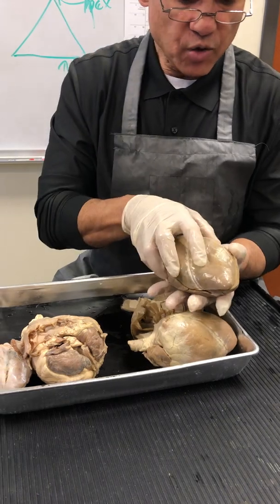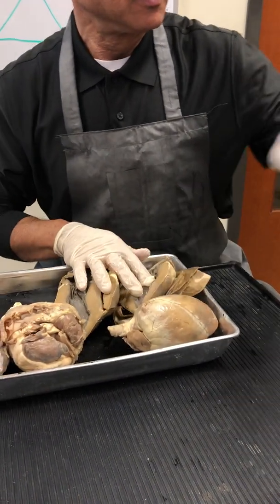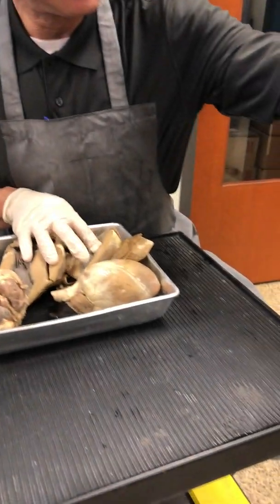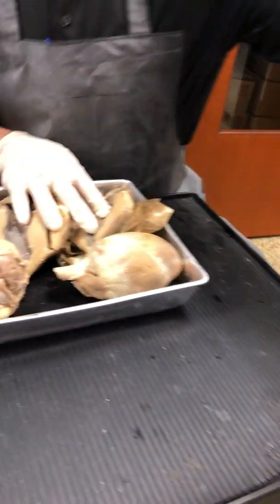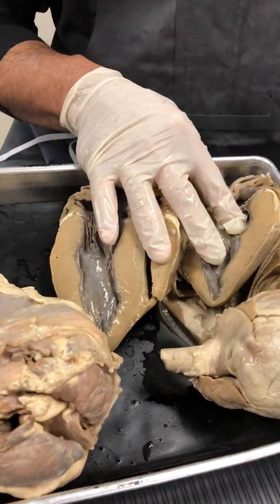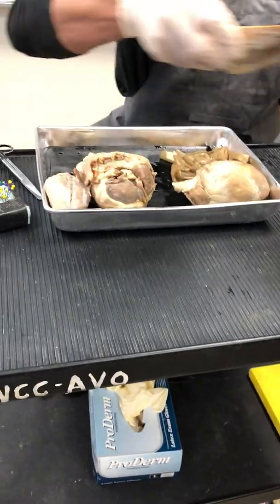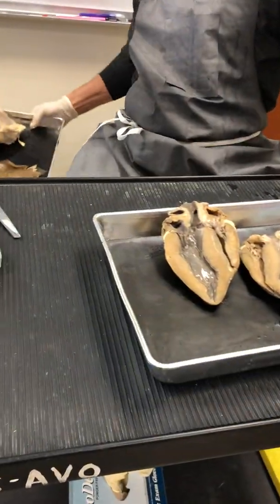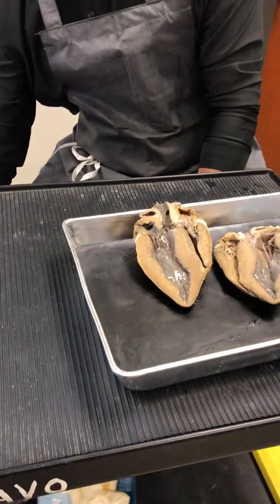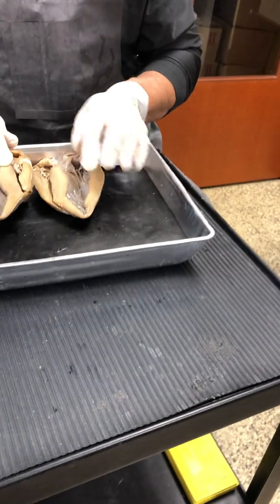So now we open this up, and what you're going to want to do here, folks, is, Louisa, just give me an empty tray there again, another big empty tray right there. Yes, thanks. Thank you, man. So now what you're going to do, folks, is just keep it next to you like that. Thank you, Brandy. So here, you just keep it right next to you like that.